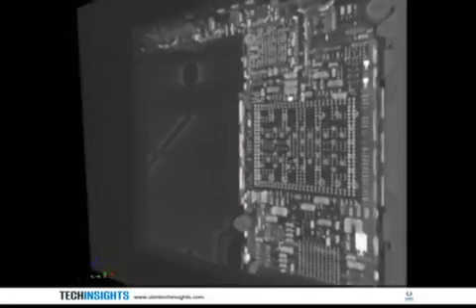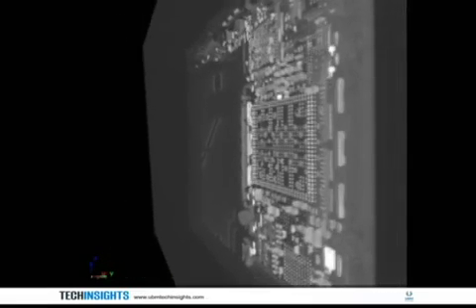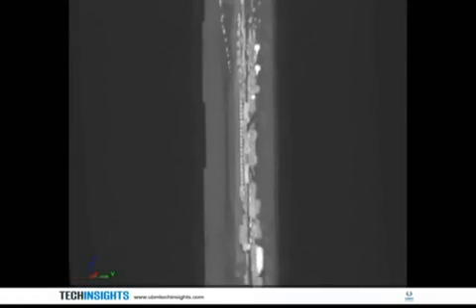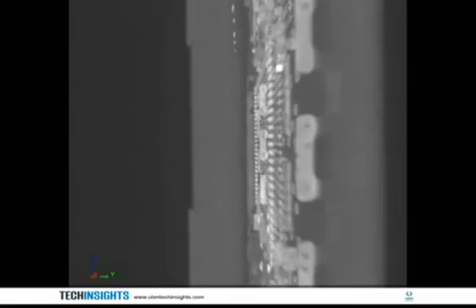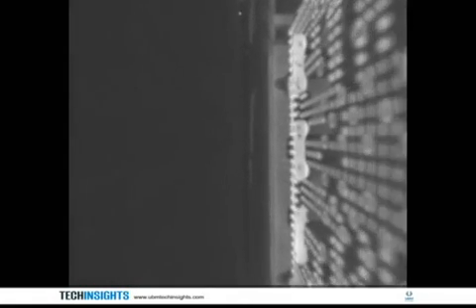The 3D x-ray viewer allows the user to view one plane or slice at a time. The slice to be viewed can be adjusted for any x, y, and z position. Note the x, y, and z axis that shows in the lower left corner of the video.